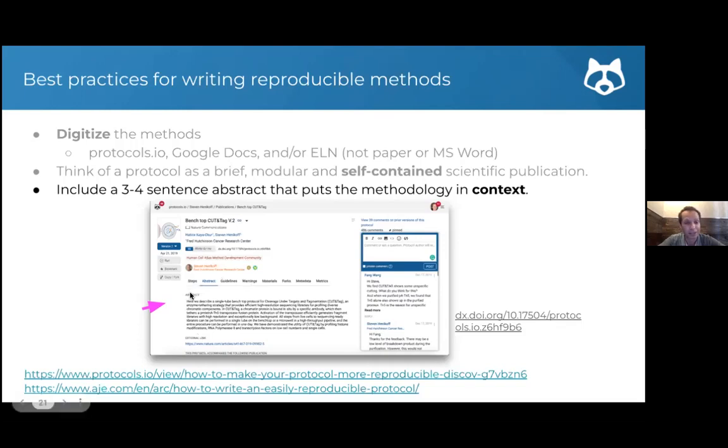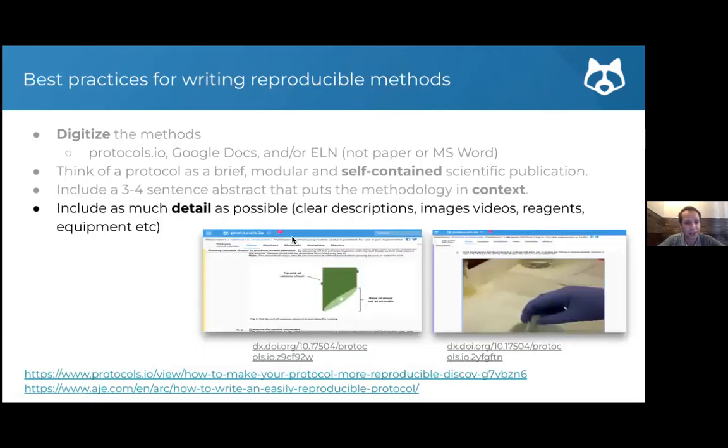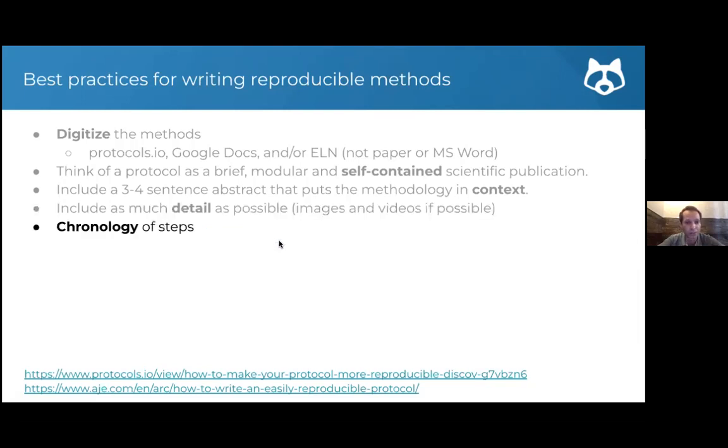The steps themselves include the necessary details, but keep them succinct so that you can run through very crisp instructions yourself if you're doing this over and over, without too many words, without too many sentences in each of the steps. So think of the two different audiences, right? The expert user and the first-time user. Do put in as much detail as you can, but pay attention to where those details go.